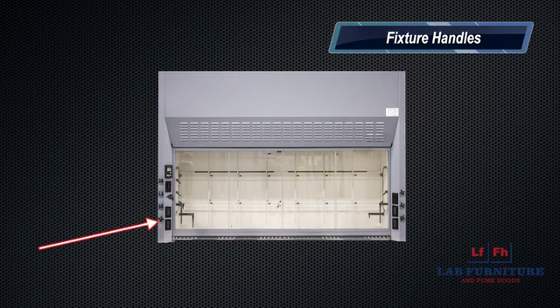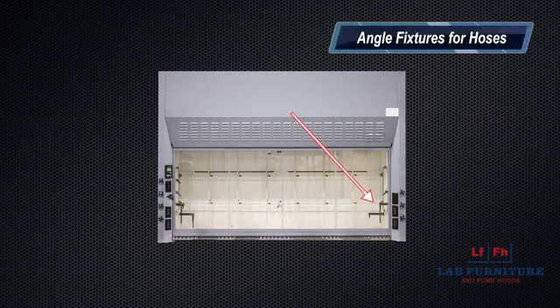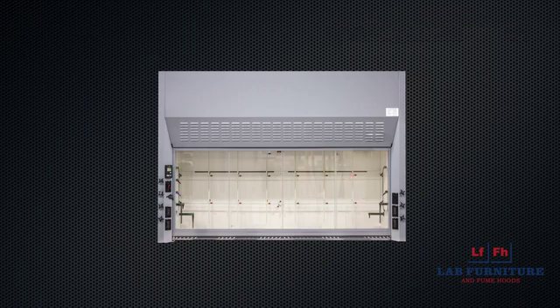The fixture handles on the front of your fume hood control the services on your fume hood. These are individually labeled with the appropriate services. The angle fixtures that are inside of your fume hood are designed to connect the hoses to them for experiments.